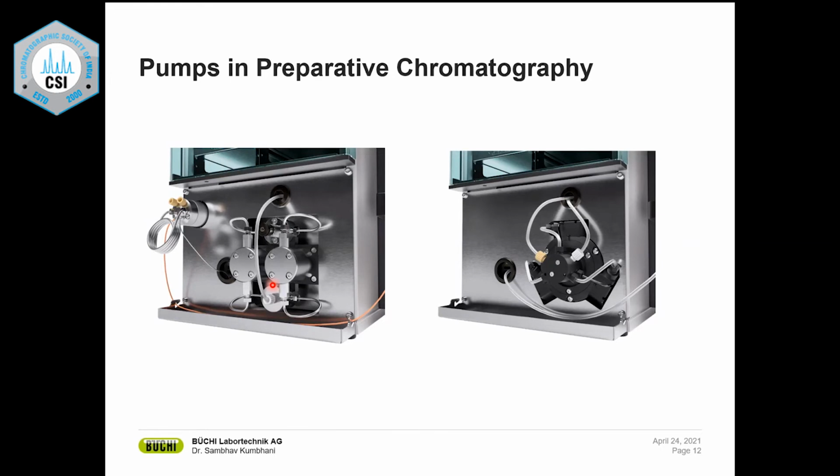And while you are running constantly, there is this push and pull going on in the pump. But the one disadvantage you have with this pump is that during this push and pull, there will be a moment where nothing is being pulled or pushed in the column, and that creates a dead volume. That dead volume enters your column and causes all the issues with your separation. It causes peak broadening, peak fronting, tailing issues, and all those things. Peak overlaps happen sometimes if they are close-eluting compounds.